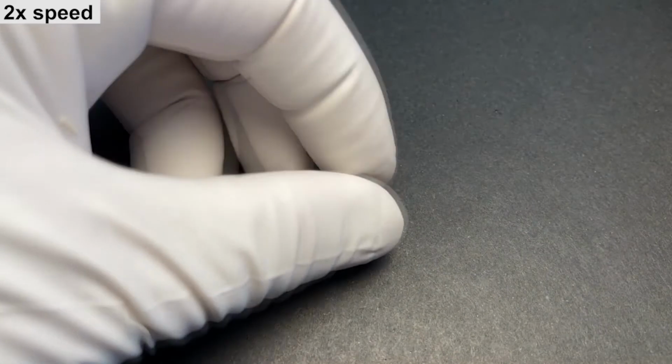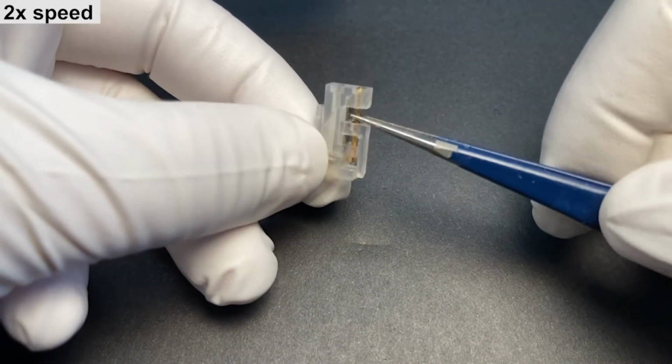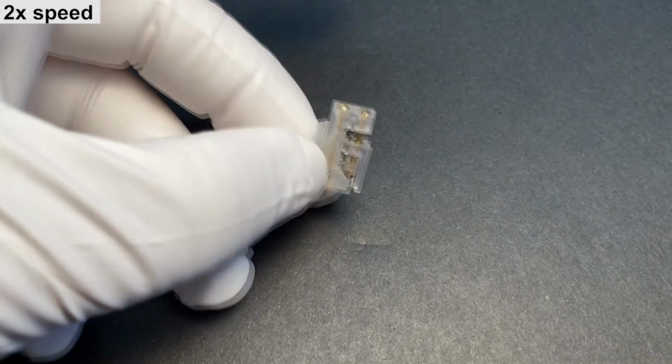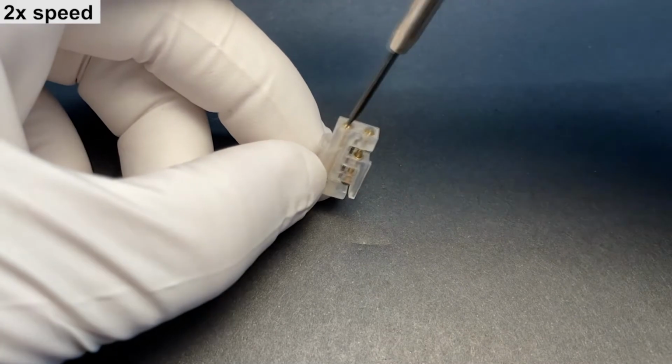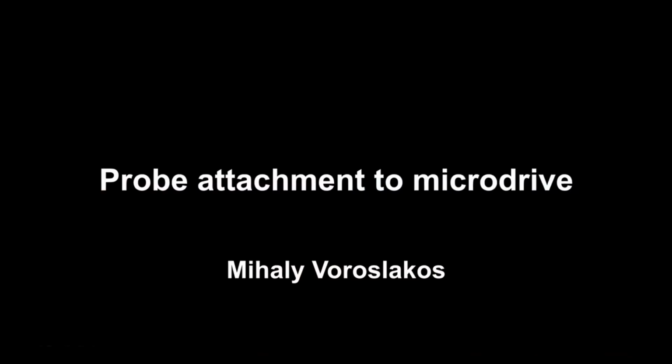And once the drive is completely assembled, then you can slide the drive into the shell component and then secure or lock it in with the back screw. So once we are done with the preparation of the microdrive, we can attach the micro-LED optoelectrode to our microdrive.